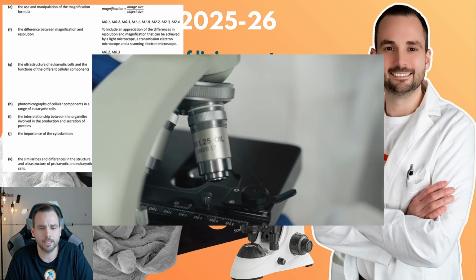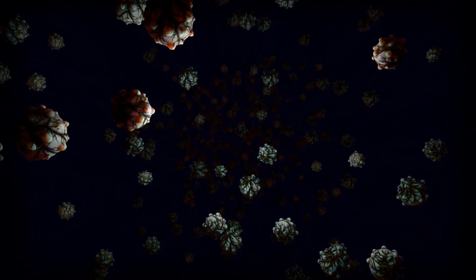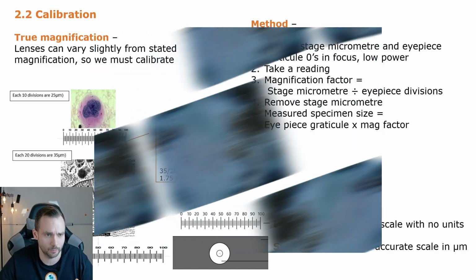Welcome to magnification and calibration. In this video we're going to be essentially learning how to use a microscope and how to make sure it is accurate, because that's what calibration is. We're making sure that something that we're using is accurate.